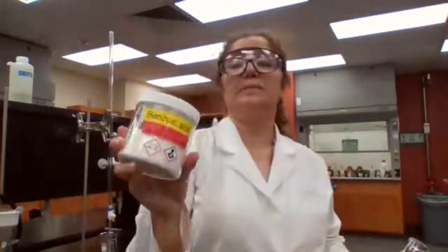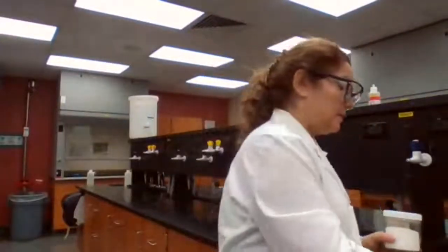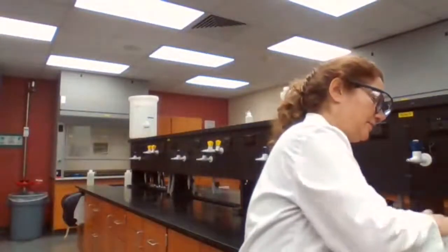0.2 grams of carboxylic acid. I'm going to continue using benzoic acid, getting 0.2 grams of the acid.